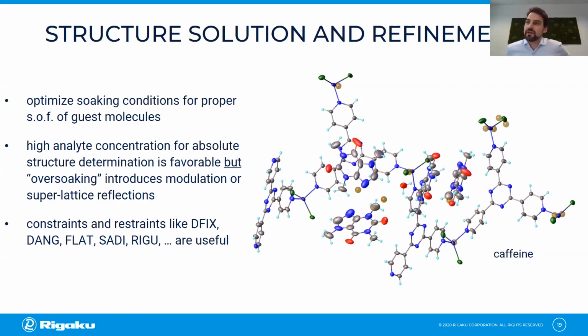Is the geometry of the guest molecule different if it is crystallized in a sponge compared to if it is crystallized by itself? Yeah, it should be. If you imagine you have a flexible group attached to your molecule, the conformation that you obtain from the crystal structure depends on packing effects. Therefore, I would expect a substance crystallized in a sponge can adopt a different conformation than crystallized by itself or as an adduct with solvent.